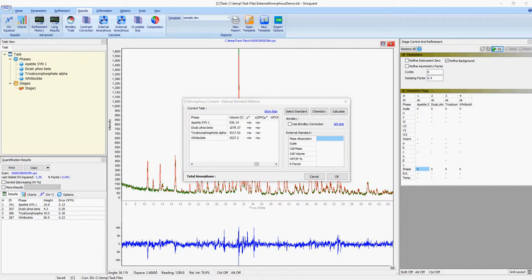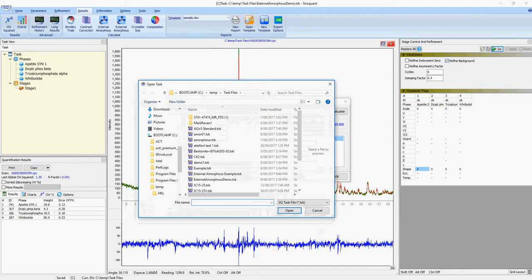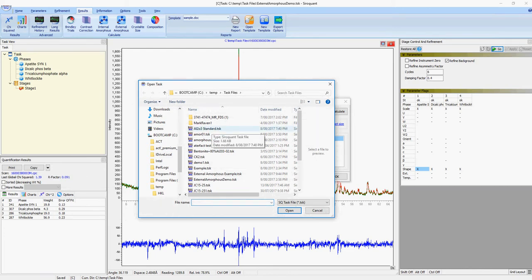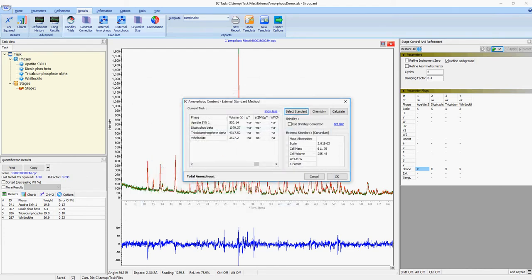The first step is to select the external standard task file, in this case, AL203 standard. Once the standard task file has been loaded, the scale, cell mass, and cell volume are extracted from the task file.